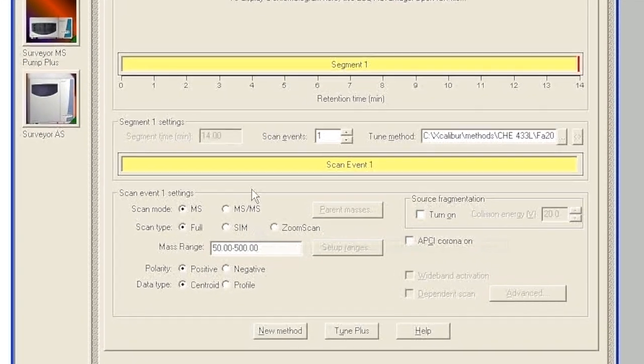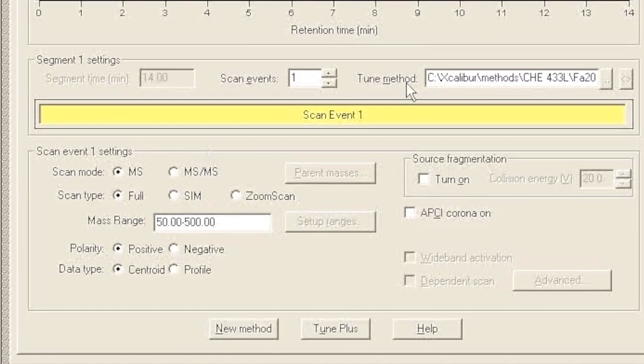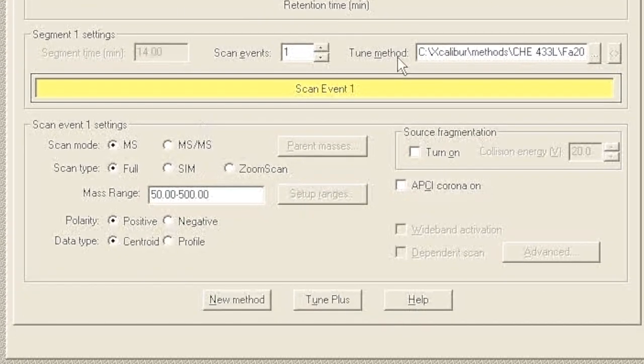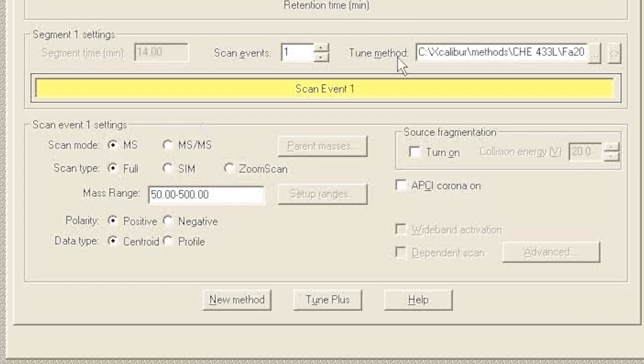We're going to program what's called a data-dependent method. What this means is that we are going to tell the mass spectrometer: run the LC run, but in real time while you're doing the LC run, if you see something that looks like a new peak in the MS1 spectrum - like if all of a sudden a big ion pops up - then quickly try to isolate that ion and also acquire an MS/MS spectrum for it.